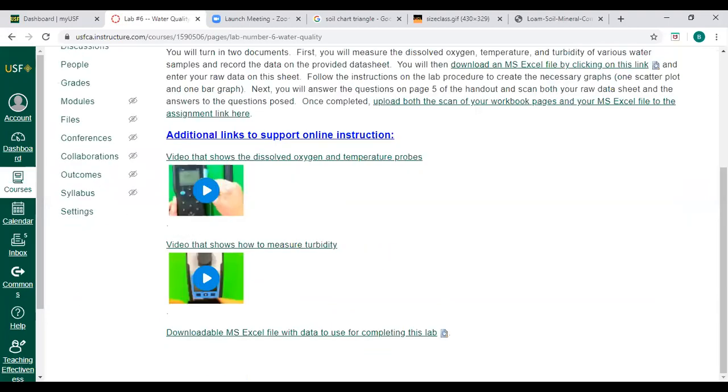But basically what you're gonna wanna get out of this lab as it pertains to turbidity is that your larger sediment particles are gonna fall out of suspension quicker because they don't have much of an attraction to each other and gravity works harder on them.